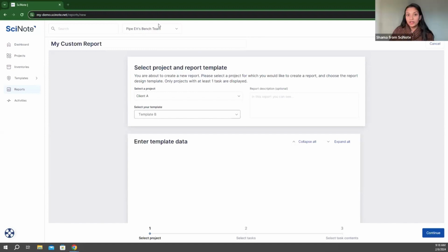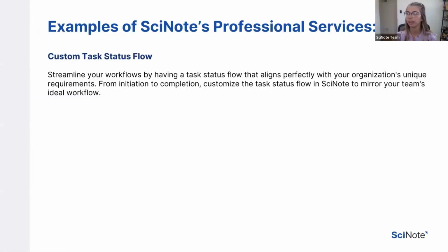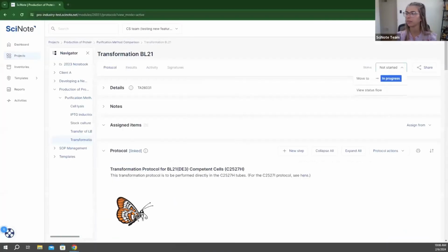Yeah, absolutely. Please email us with the specifications of your use case. You can email us at premiumsupport@SciNote.net. You can even email your CSM specifically, and we can get that covered. And let me move forward a little bit back to where we were.